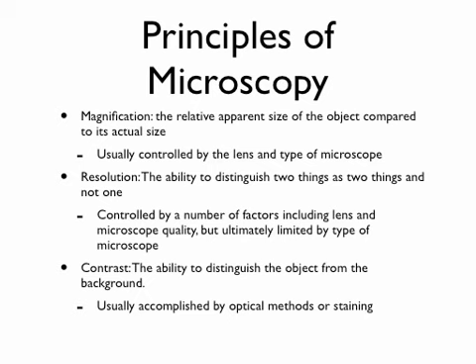Who can tell me with surety whether that's 1 dot or 2 dots? Raise your hand. You got a couple of people with really good eyes. So I get about here, and I can no longer tell if it's 1 sort of funky shaped dot or if it's 2 dots side by side.